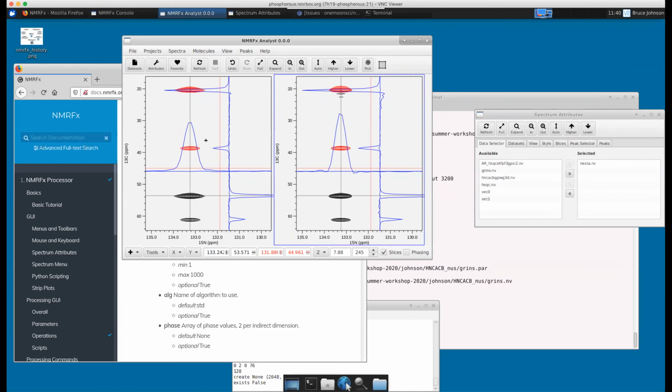Yeah, thank you. There are lots to explore, actually. There's no reason you can't process a file in SMILE or IST and all the other ways that you learn about in the NMRbox workshops, and output those into NMRView or UCSF format and pull them in, so you can compare right side by side here with processing done somewhere else.